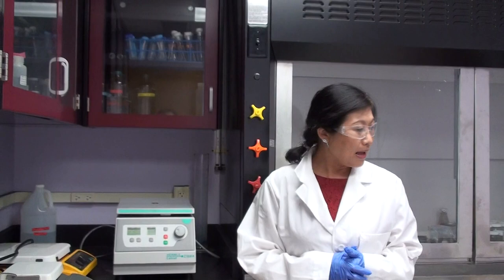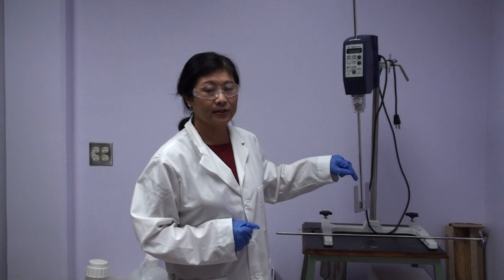And then we do have another equipment over here we call mixer. So basically, we mix the solution and powder, the solid mass together, to set up different rotation speed and test the shear rate. This is very useful if you do want to mix polymer solution with different molecular weight.